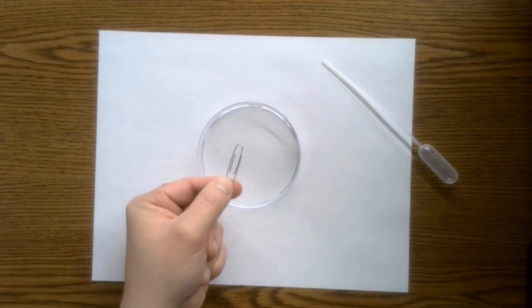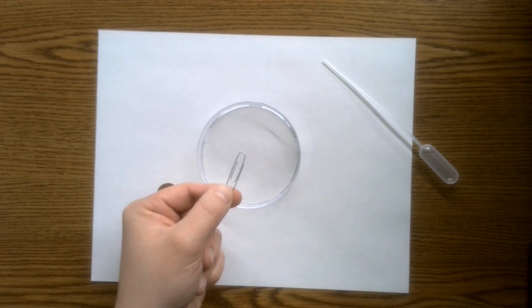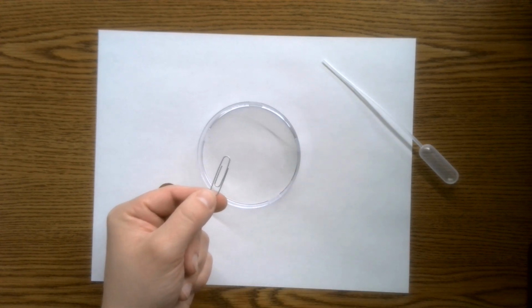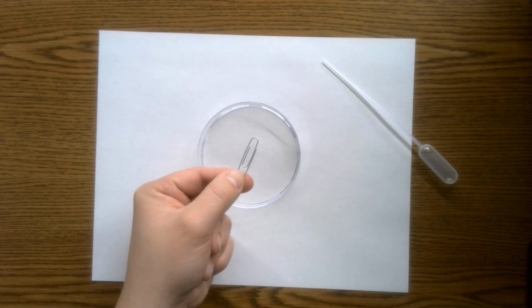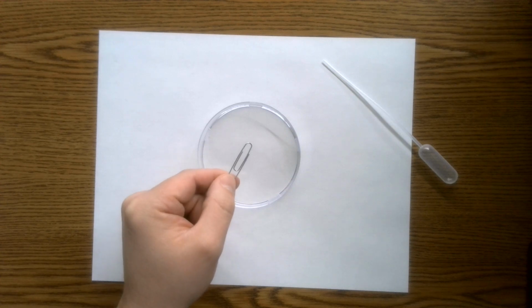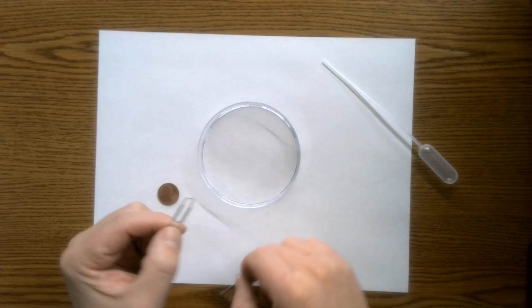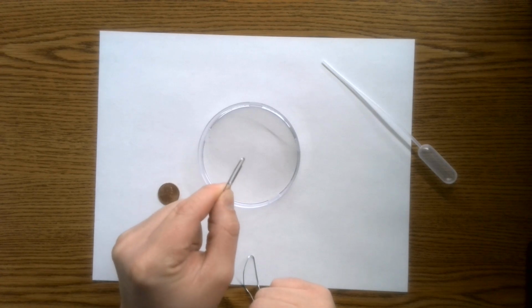Okay, the reason this can float is because it's light enough and the area is distributed enough that the hydrogen bonds don't break, and we call this surface tension. So this is light enough to sit on the surface of water without breaking through the surface and hitting the bottom of your tray. Okay, and if it does fall down, a trick to this is to dry this off again and try it. It's best if this is dry and not wet.